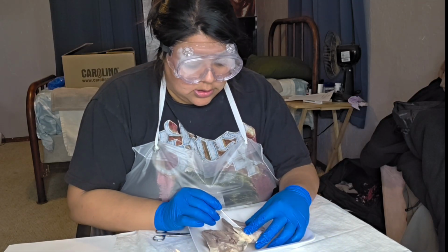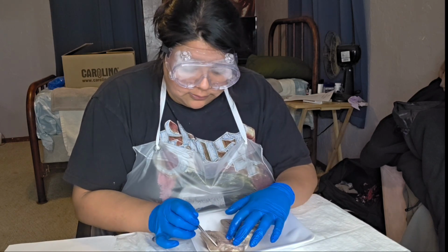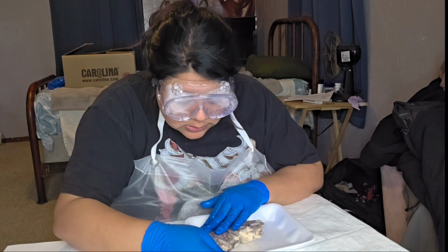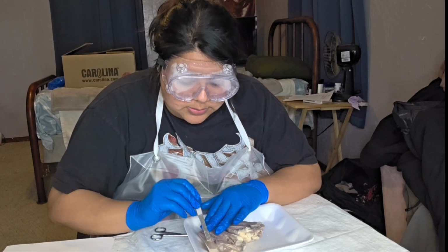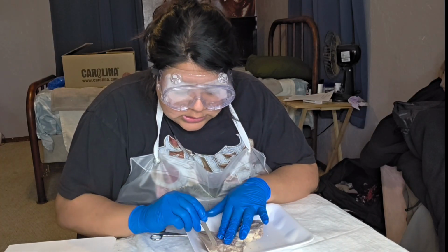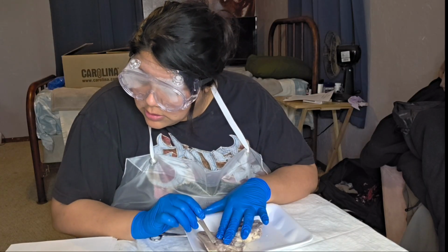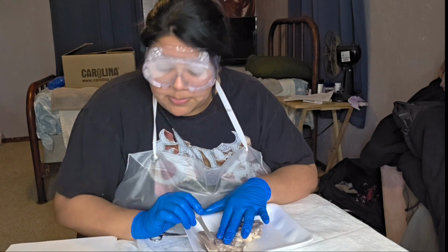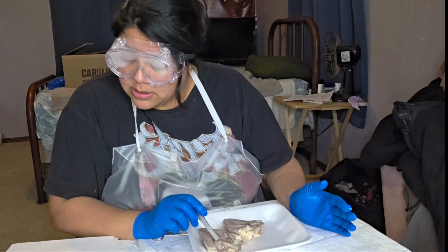We can see on the other side, it was our tricuspid valve. So here we can see our opening, and then down into here, we can see our bicuspid valve, or our mitral valve.